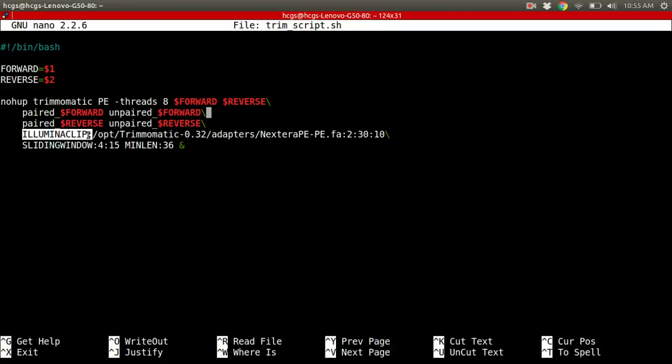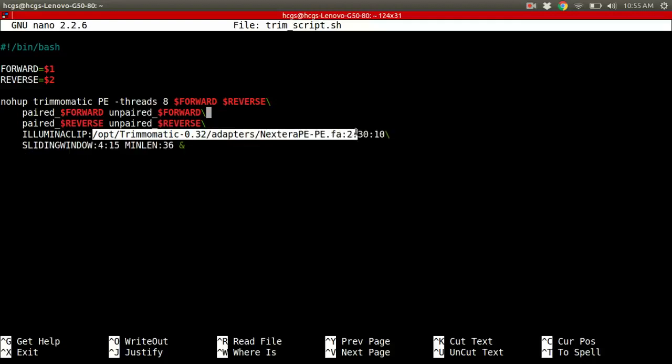And this is just the pathway to it. This is the default pathway. So if you've installed Trimmomatic somewhere, this should exist as the default pathway. So if you give it this, it should still point to it if you have this installed on a different server. And if you want, you can go ahead and give it your own set of custom adapters if you like, because all an adapter file is just a FASTA file containing the sequences that you'd like to get rid of. That's it. So these are pretty small sequences. You can go ahead and check them out if you'd like.